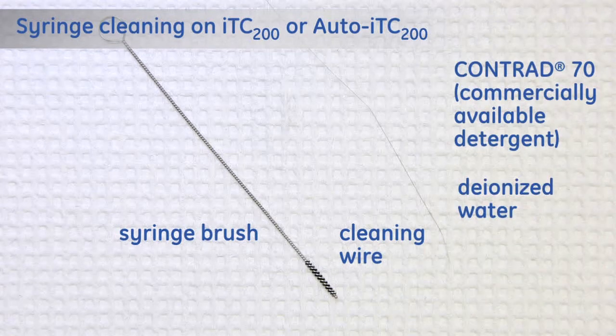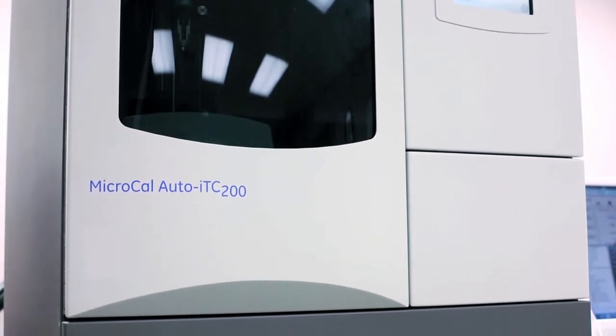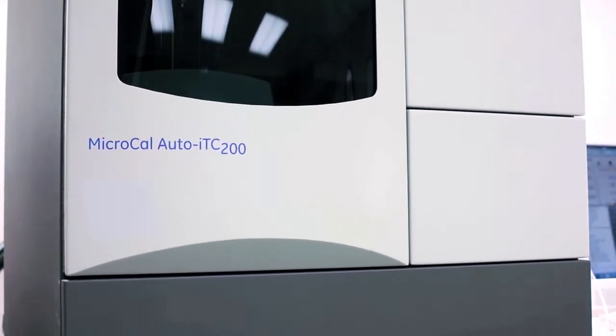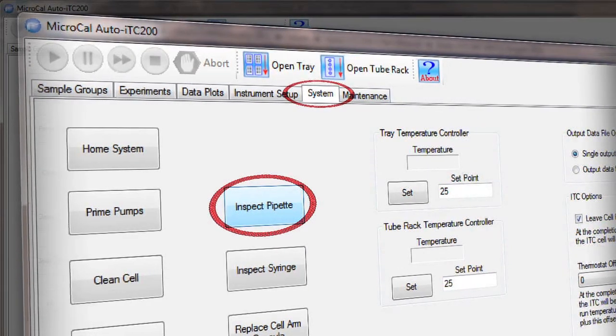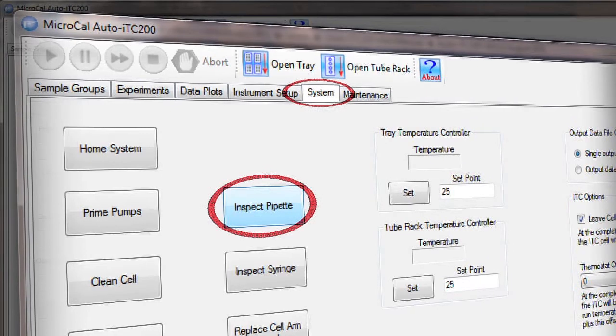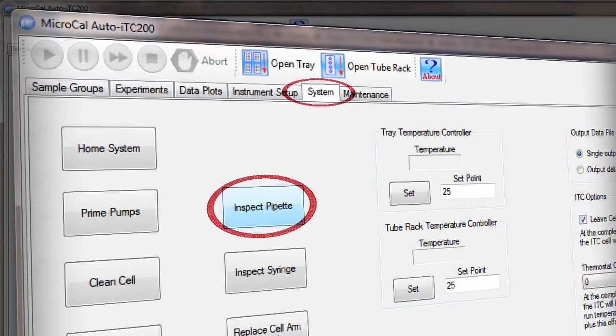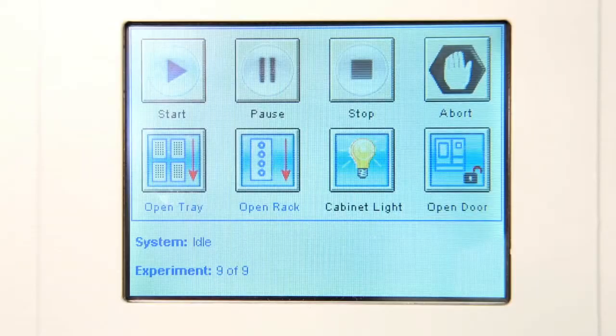To remove a syringe, you need to start with the door closed. Then click the Inspect Pipette button in the System tab of the Auto ITC 200 software. This brings the pipette arm around to the front, where it's more easily accessible. Now we can open the door.